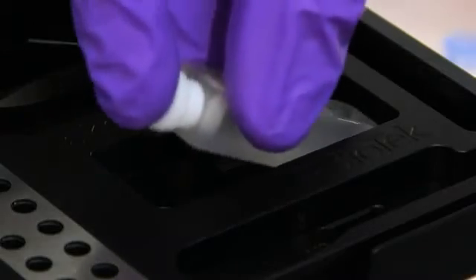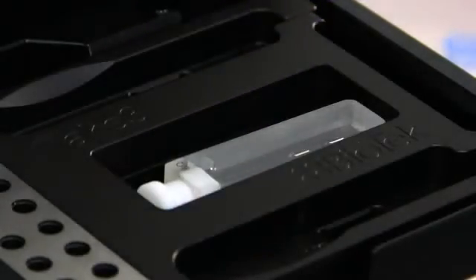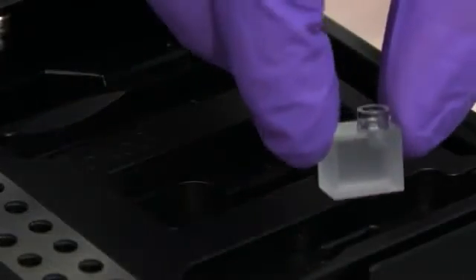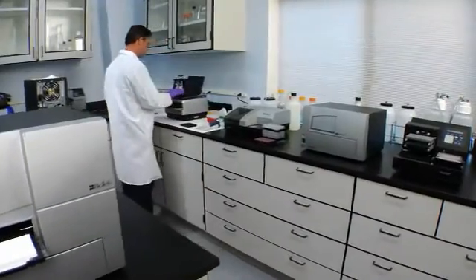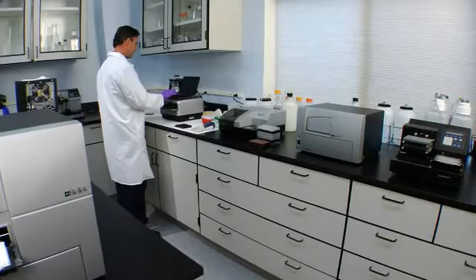The Take 3 plate and EPIC Reader, used as a system, provides great flexibility to support all your laboratory needs, from low-volume nucleic acid quantification to biomolecular assays in 96 well plates.